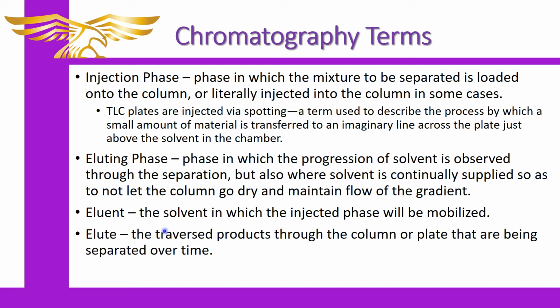As far as the eluent itself, that is the solvent that does the elution phase, and it acts as part of the mobile phase and promotes the mobile phase. The eluates are the items dissolved in the eluent. So it's like solutes and solvents: eluents and eluates. And eluates can be many things. Eluates can be proteins, salts, organic chemicals or inorganic chemicals, depending on what you're separating.